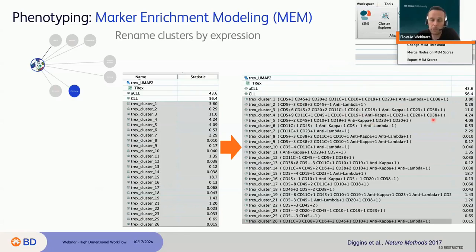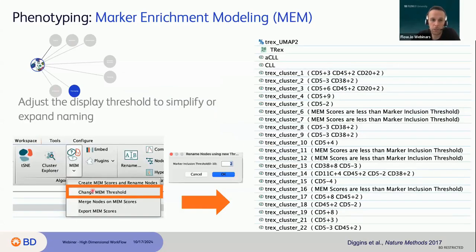This list might be huge depending on how many markers you have in your experiment. So you can apply a threshold to decrease that size. So let's say if it's not at least a vector of 2, I don't want to see it, and that allows you to have a list of markers that's more readable and allows you to define your different clusters.